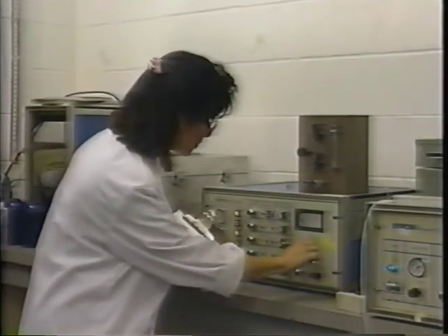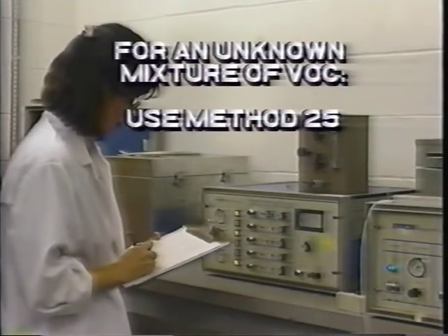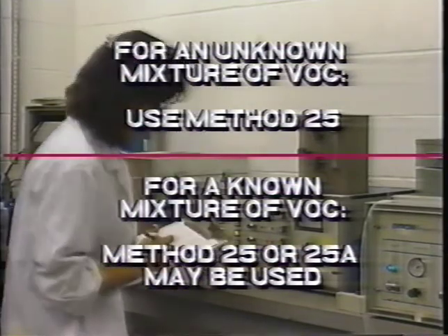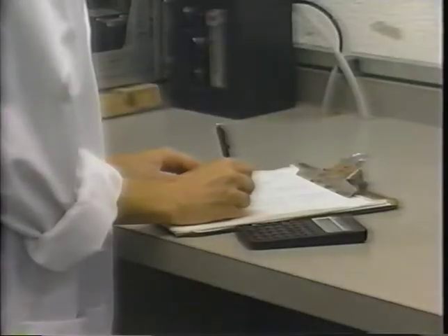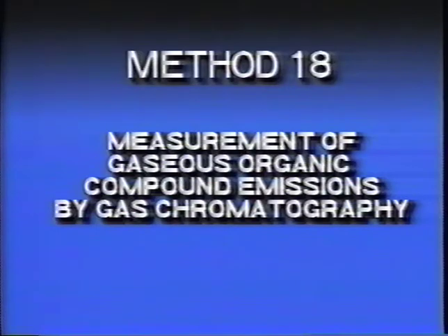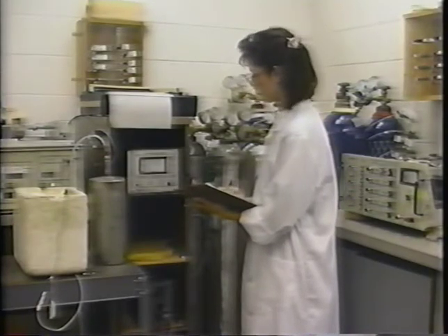Otherwise, in general, for an unknown mixture of VOC, use Method 25 when a total VOC measurement is needed. For a known mixture of VOC, Method 25 or Method 25A may be used. If quantification of specific compounds is desired, consider using EPA Method 18, entitled Measurement of Gaseous Organic Compound Emissions by Gas Chromatography. The last section of this presentation deals with commonly asked questions about Method 25.